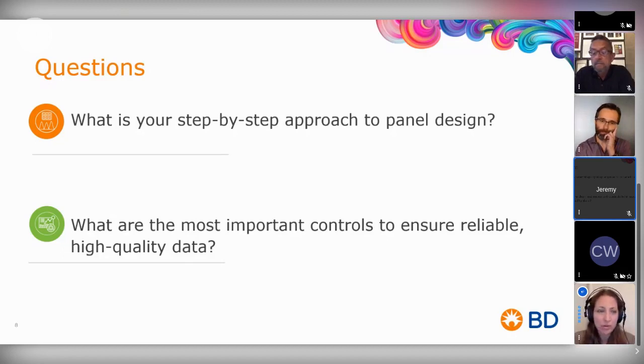I like your approach very much, and I also agree with what Mirko said. You have to know what you're working with, and that's at the level of the biology of your samples, as well as the instrument and the fluorochromes, whatever reagents you use to interrogate your samples. I always like to lead with the biology. So what are you trying to address with your panel?